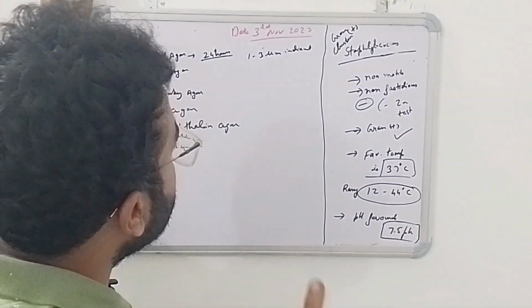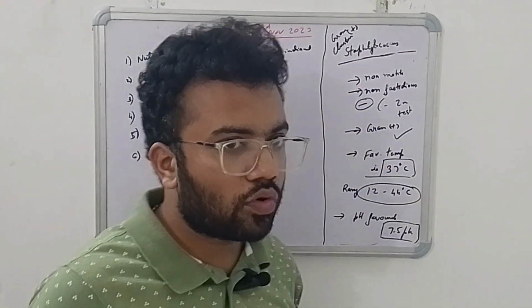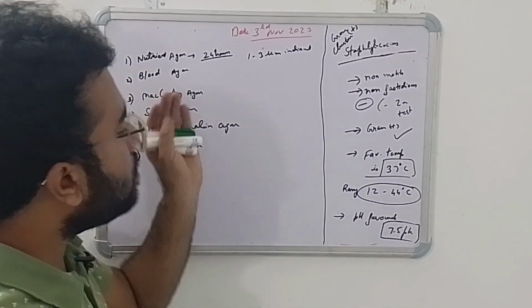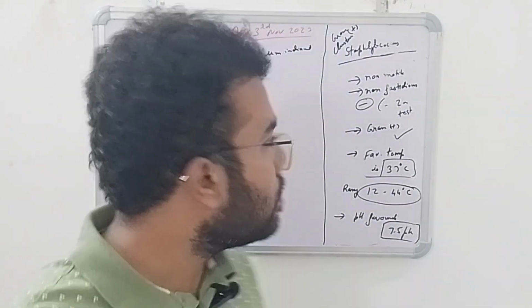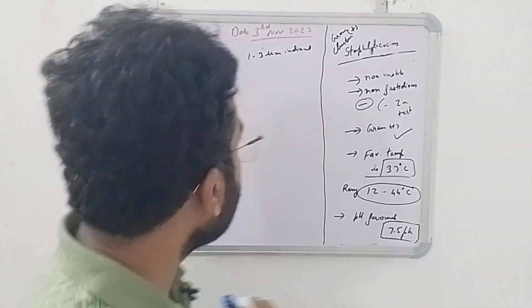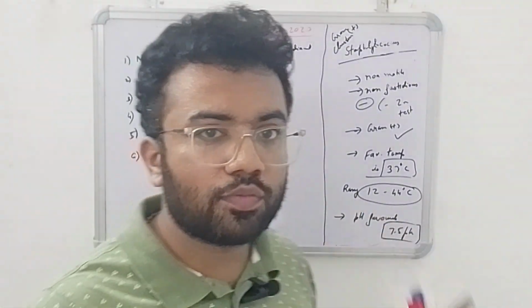Some other species also show golden yellow pigment, but most Staphylococcus aureus has a golden yellow pigment, and the colonies will be glistening on the surface. It is placed for 24 hours of incubation.